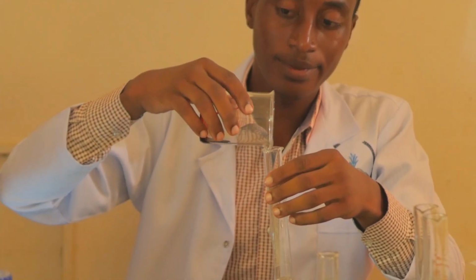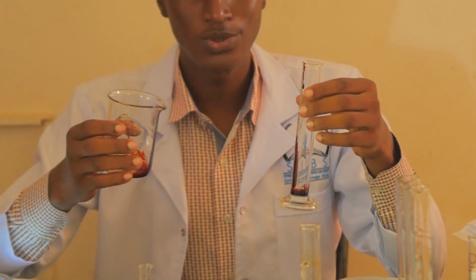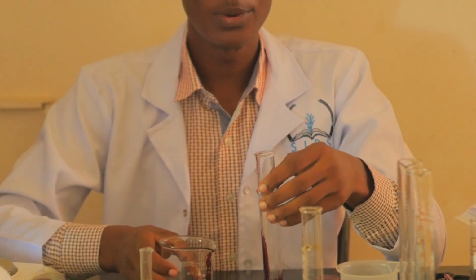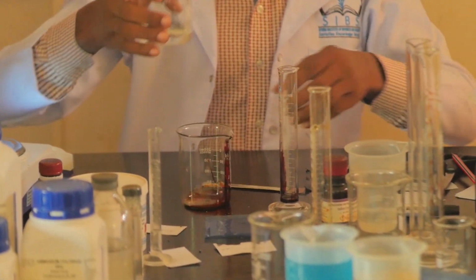We need to shift this preparation to the measuring cylinder or to a calibrated bottle so as to obtain the required amount. So to obtain the required amount, I'm going to shift this to the measuring cylinder. So when I take the reading here, this is not 20. So I'm going to add alcohol, which was my vehicle, to make up to 20 mils. So here is alcohol, 90%.